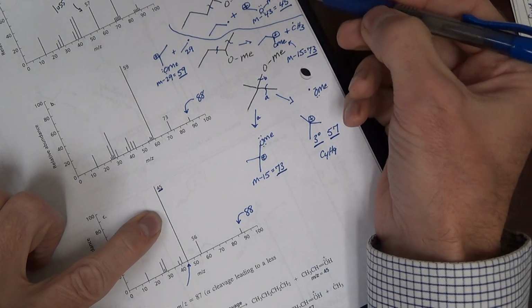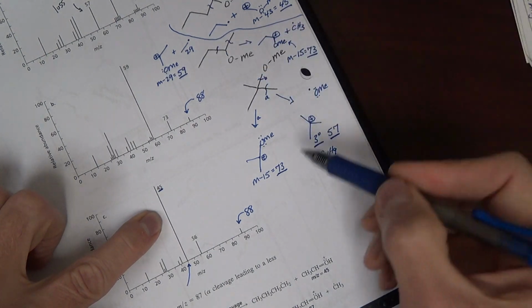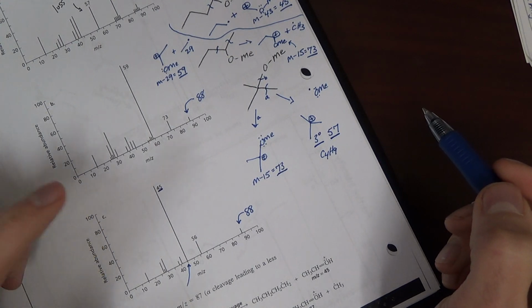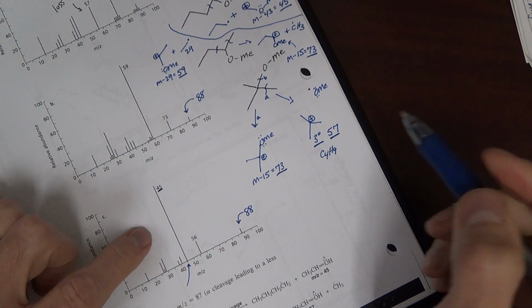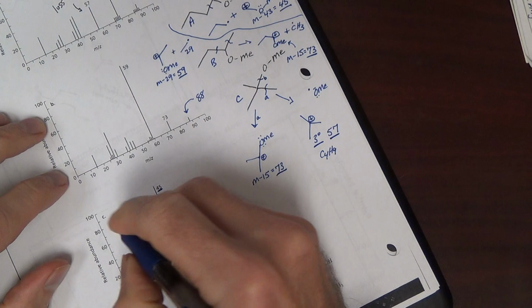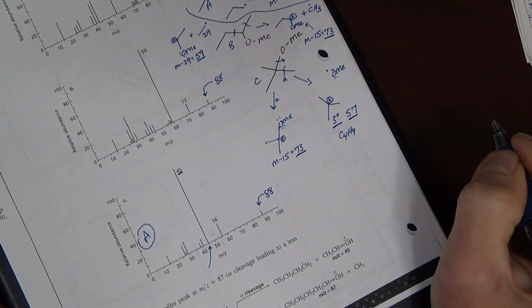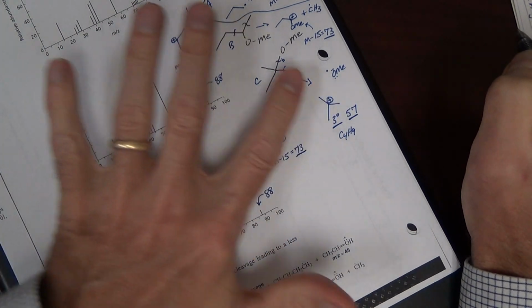Did we predict a 45 for the other two compounds? No, and no. Based on that, it looks like to me that the third spectrum is the first compound. If we label these as A, B, and C, I would call this compound A. Now we can always go back and change this. Let's see if the others match.